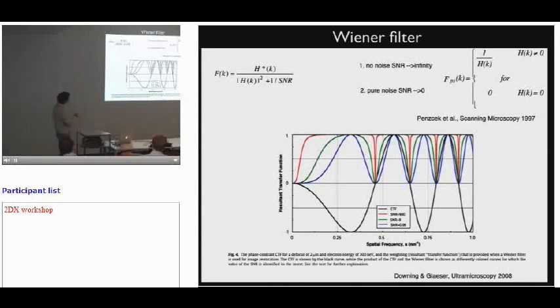So you have your images carrying a defocus, a CTF squared on them, and then you divide by the CTF squared. However, the problem remains at the intercepts, because you can divide by zero, right? So what you have to do is slightly lift that by a certain constant, and that is signal to noise dependent. And this way, you can then recover that information.